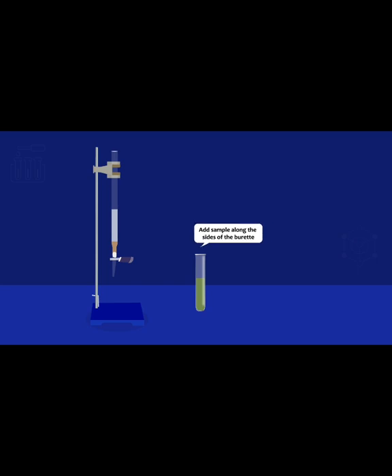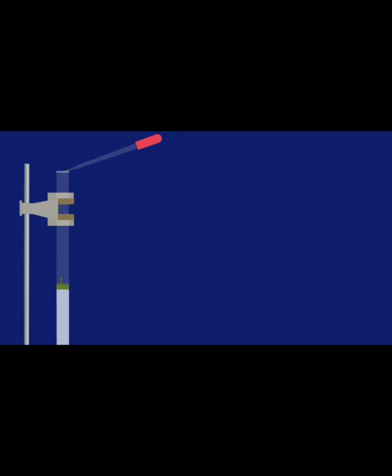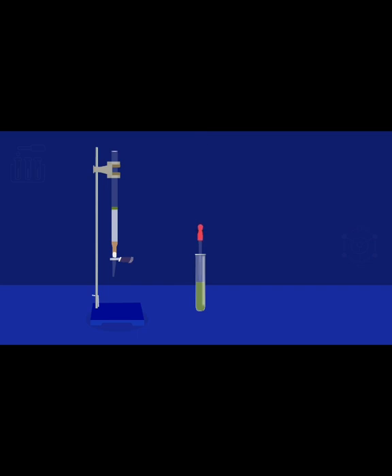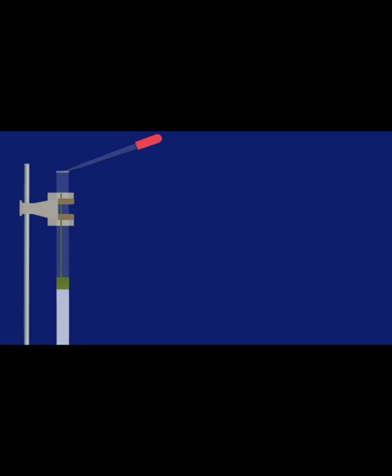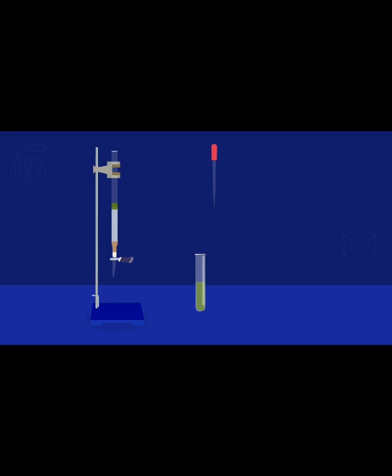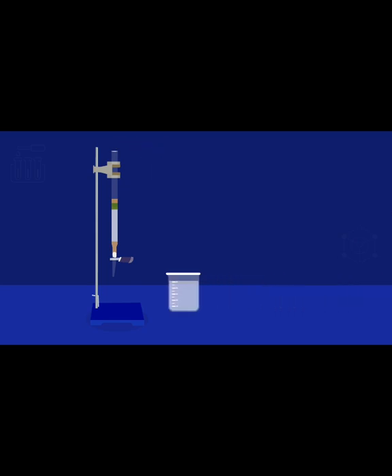Add the sample using a pipette into the column containing the stationary phase. Further add fine sand on top of it, followed by silica gel or alumina gel on top.